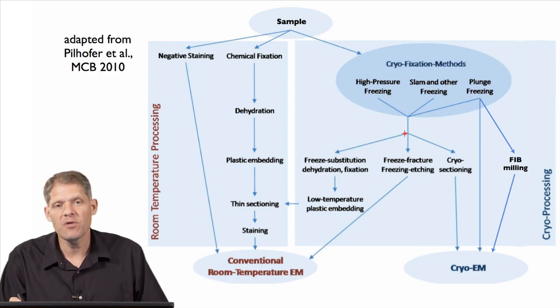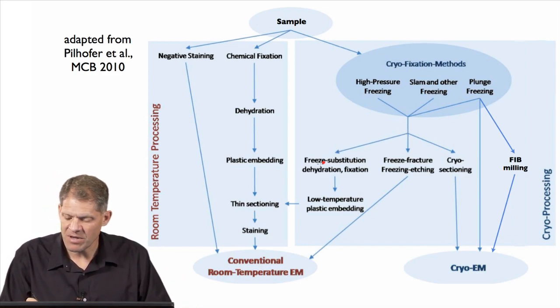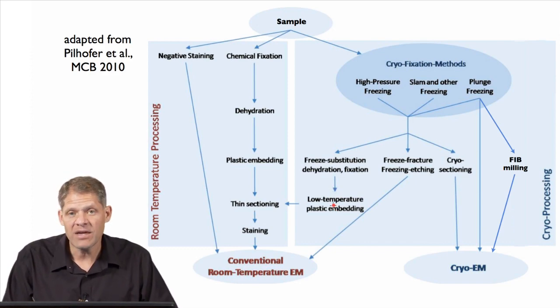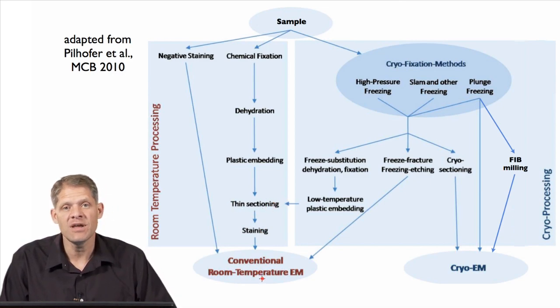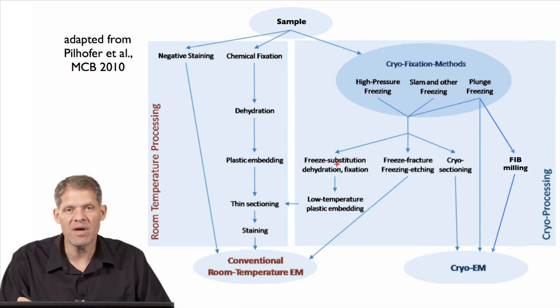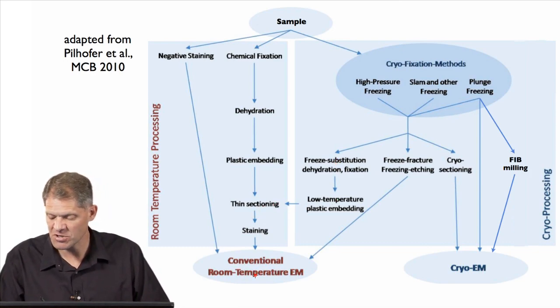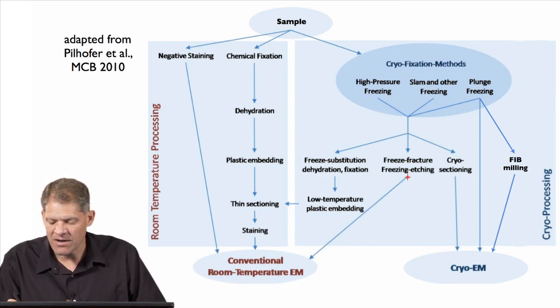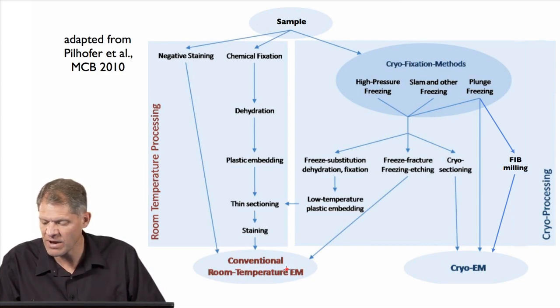Following the high pressure freezing, samples can be freeze substituted, dehydrated and fixed, low temperature plastic embedded, and then once they're embedded, they can be warmed to room temperature, sectioned, stained, and then inserted as a room temperature EM sample. So this is the high pressure freezing, low temperature embed route to a room temperature sample. These kinds of samples can also be freeze fractured, freeze etched, and other techniques we haven't described yet. And eventually these also lead to a room temperature sample ready for insertion in the electron microscope.